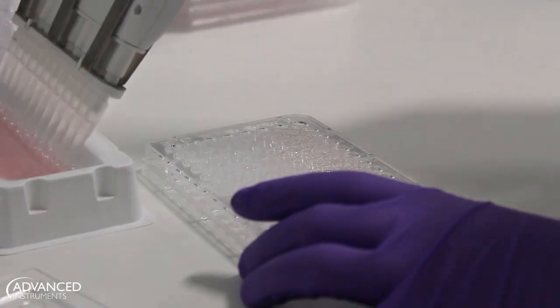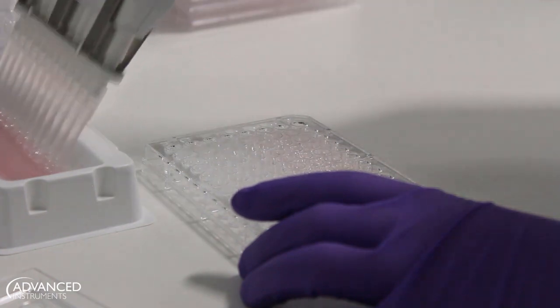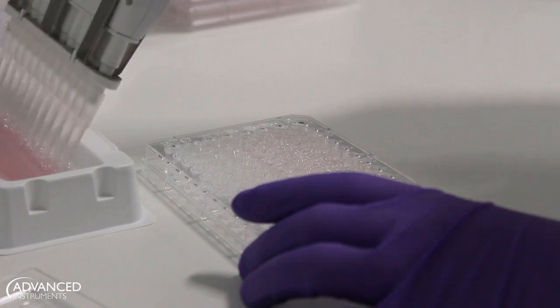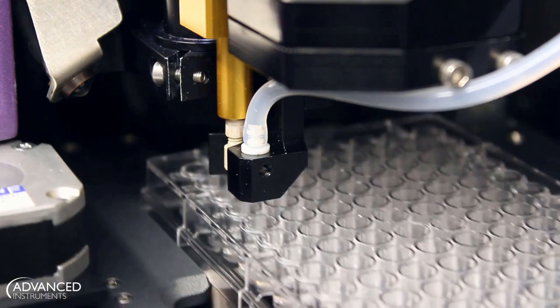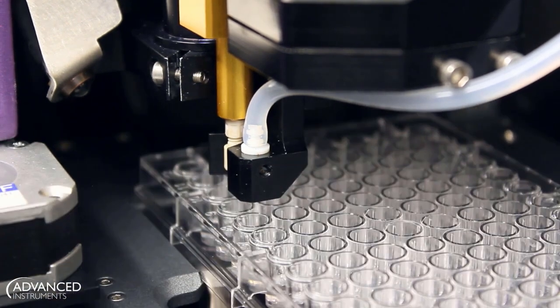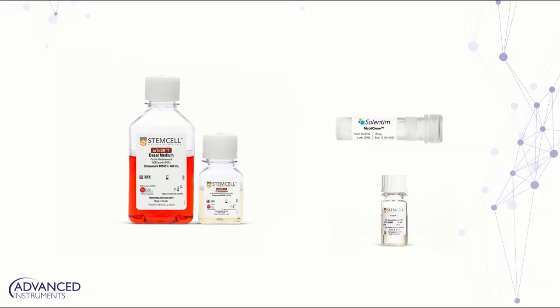It is important that limiting dilution plates and serial dilution plates are always set up alongside your VIP seeded plates using the same cell suspension and growth medium. On the day of your seeding experiment, enough outgrowth medium to seed your 96 well plates with 100 microliters of media per well should be prepared.